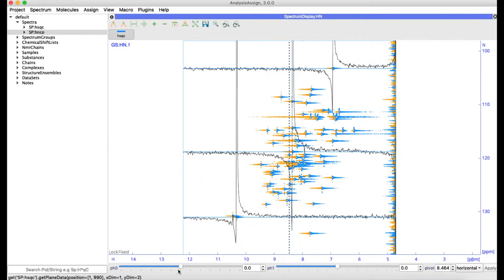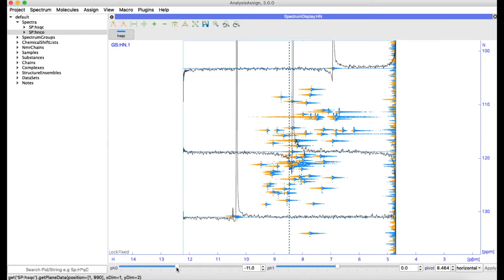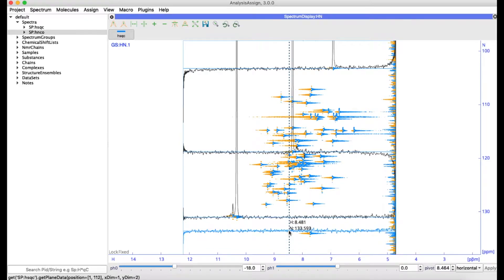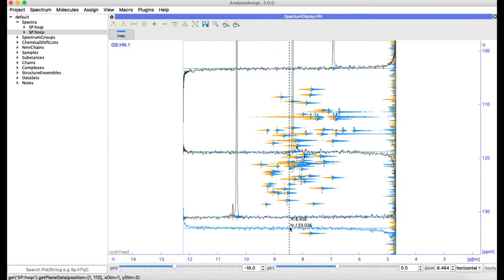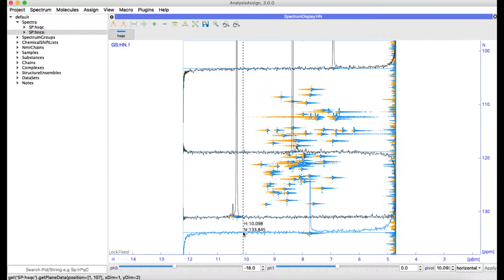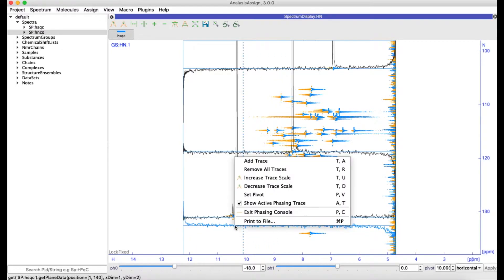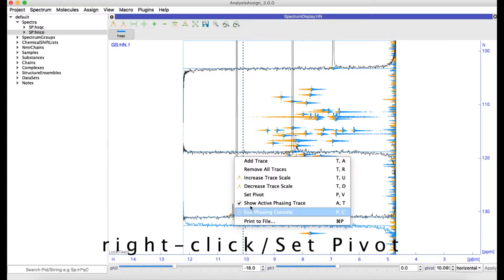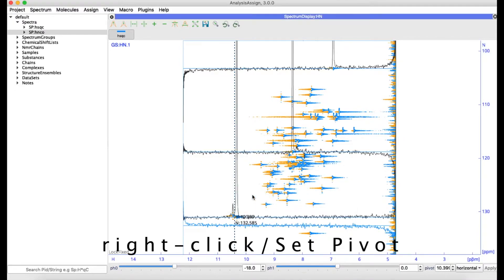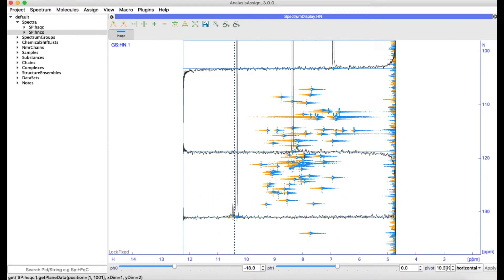You can then phase your spectrum using the sliders below. The pivot is shown using the dashed line. If you want to move this, simply drag it with the mouse or place it at the mouse position using the right-hand mouse menu. Or you can set the value directly in the box below.